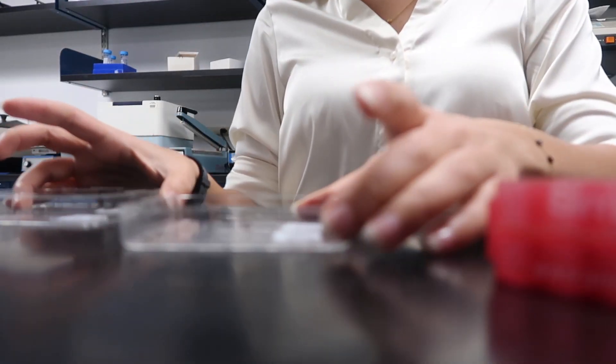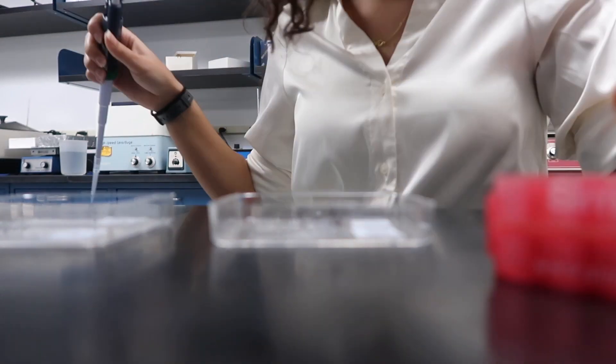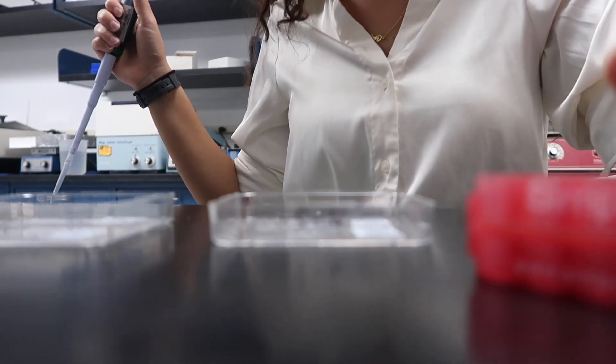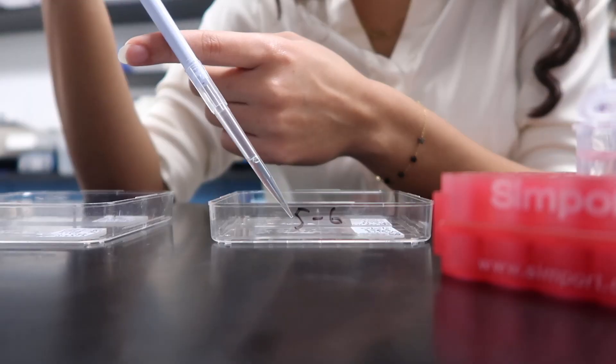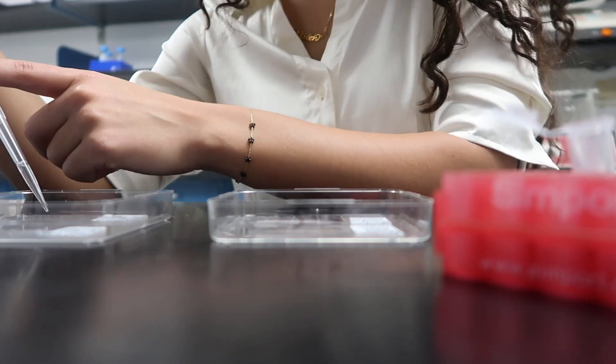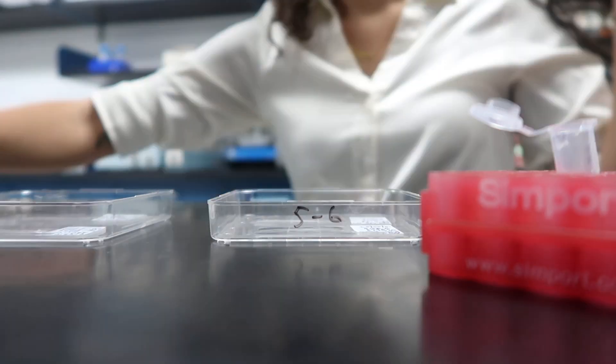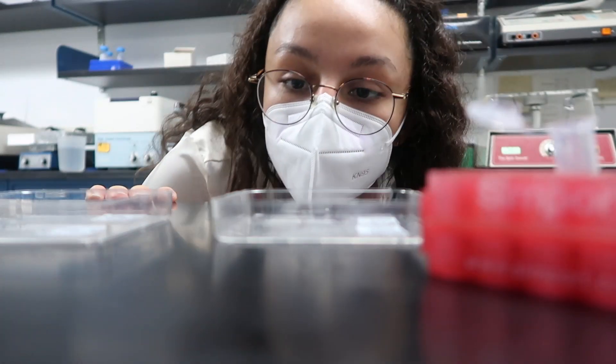That must slide. Here, I'm going to start with like 250 because I'd rather place a little less and then have to add more, other than adding too much.